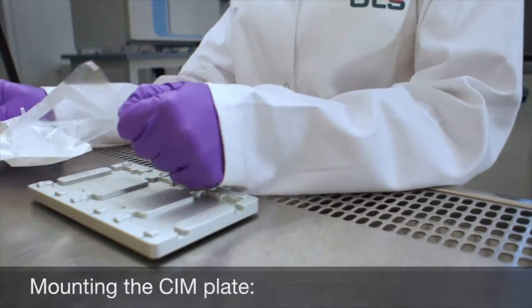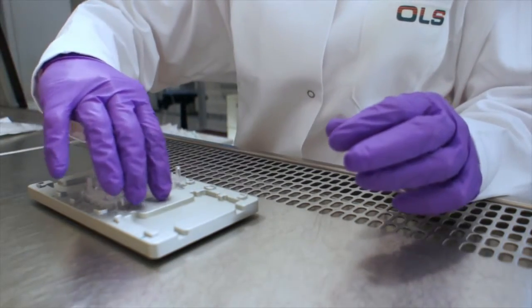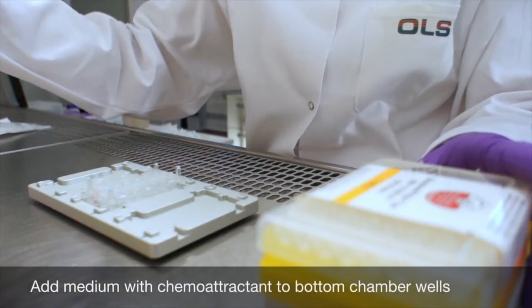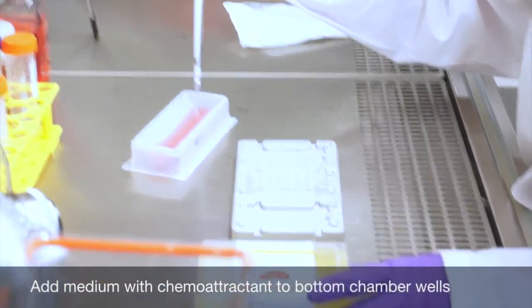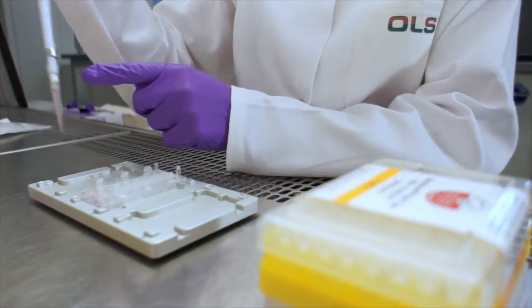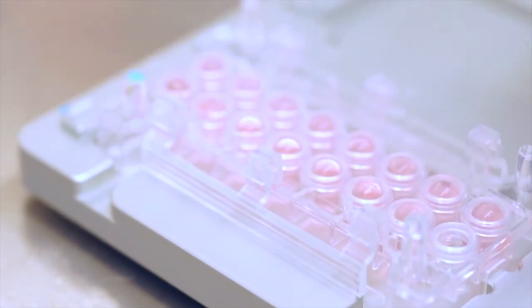To mount the SIM plate, place the bottom chamber in the assembly tool and add the medium containing the chemoattractants in each well. The slight liquid meniscus ensures the correct sealing without air bubbles.